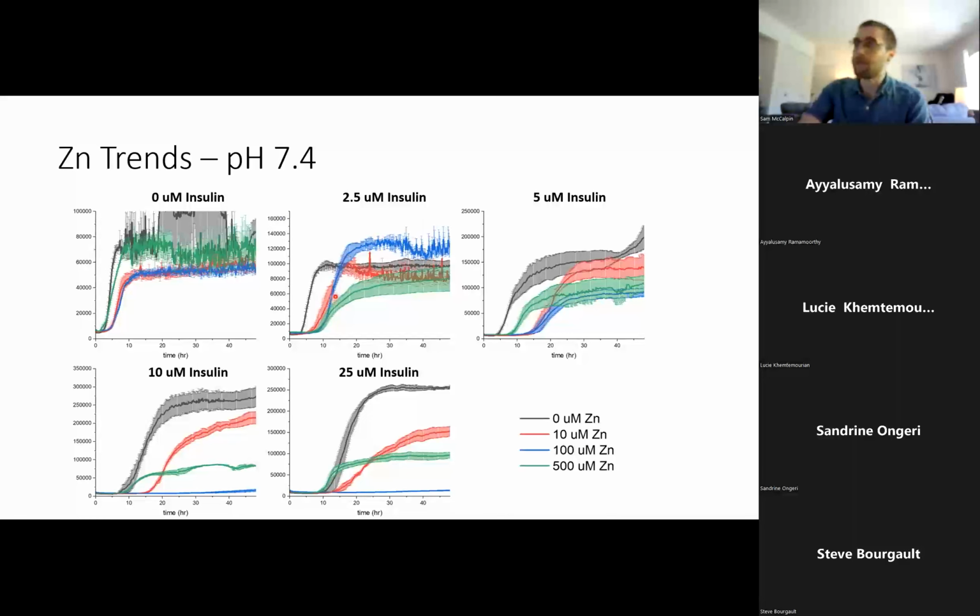I think some of the previous speakers have given some good suggestions about how we can improve that. But we can see that the curves are clearly distinguishable from each other. The error bars don't overlap, and we can clearly see the differences between the different conditions. And as Lucie said, between our 2 labs, we generally see the same thing. So we were able to, it seems, solve this reproducibility issue just by systematically going through changing the parameters and deciding what's best.